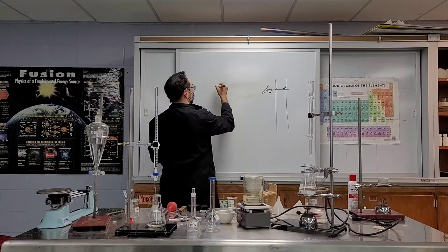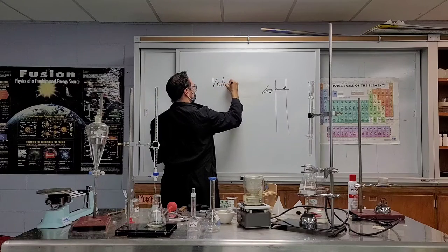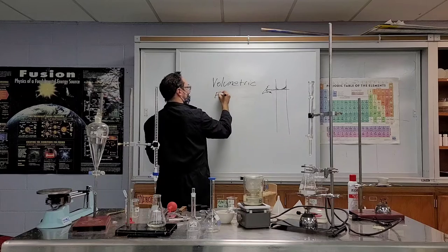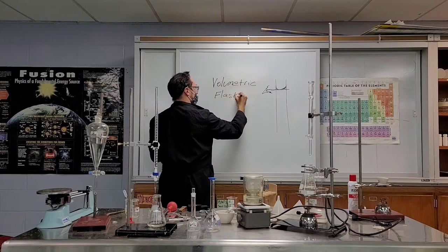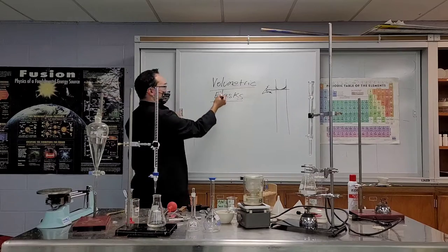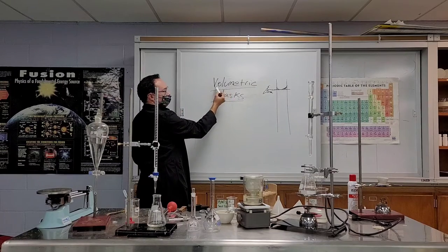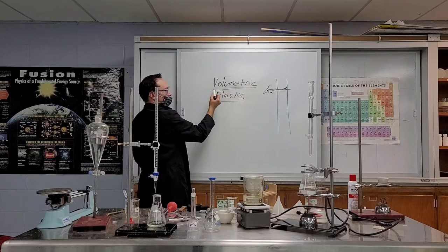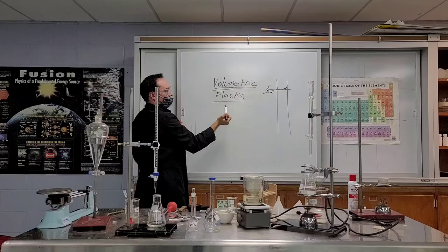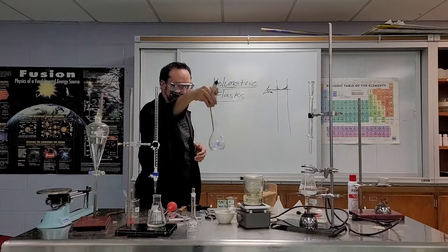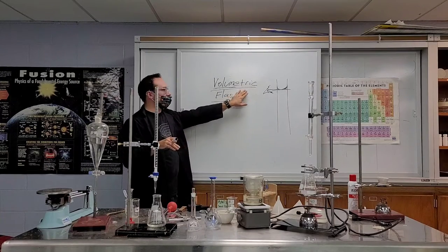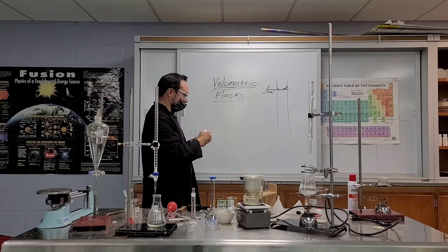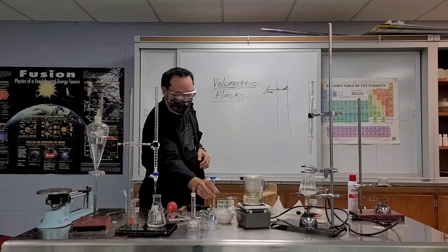They are called volumetric flasks. Take a wild guess why they're called volumetric. Metric means to measure and the amount of space something takes up is volume, so these are flasks that accurately measure a certain volume. I'll bring one close to the video so you can see it.